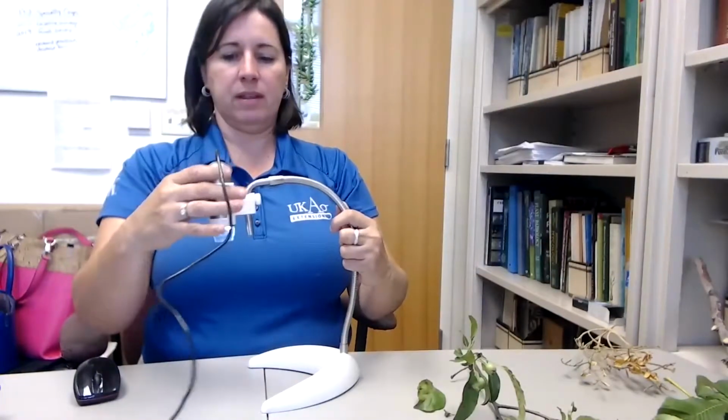Okay, so Dyno Light is a good shareable USB scope. It's still taking pictures if you can hear it clicking. And again, this jiggly stand is the one that you probably all have. This is the one that came with it, and this is the one that I just don't recommend.